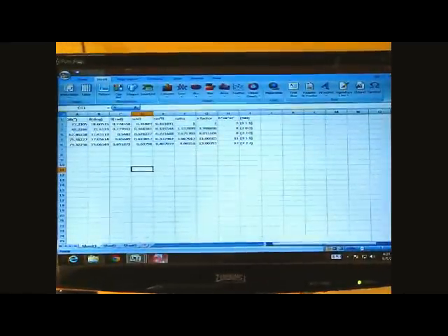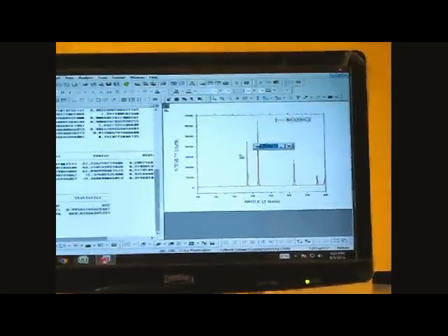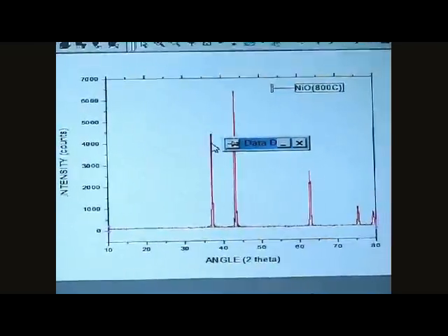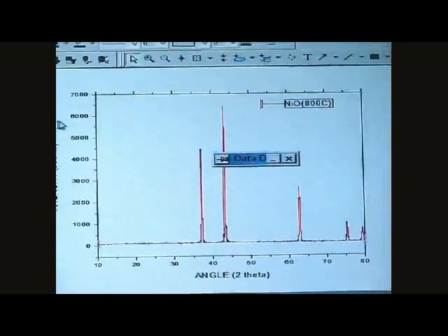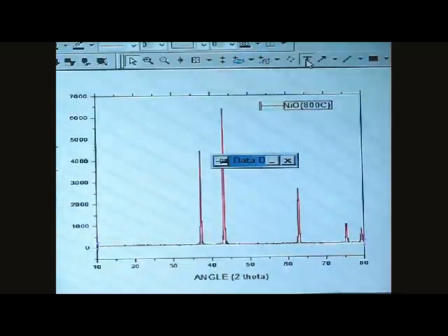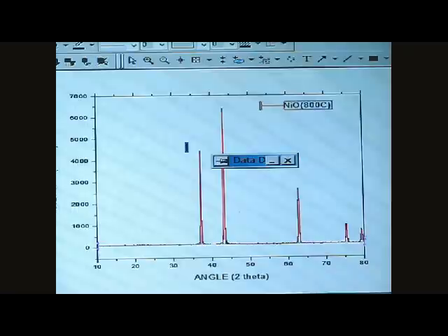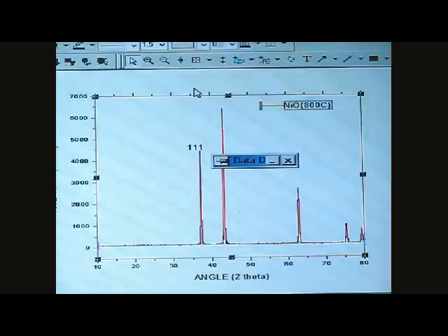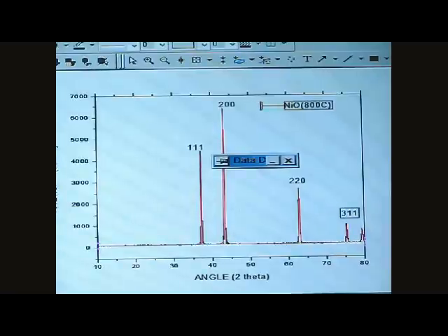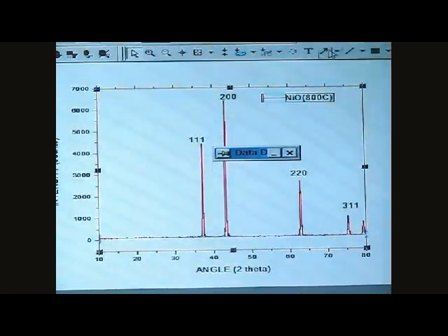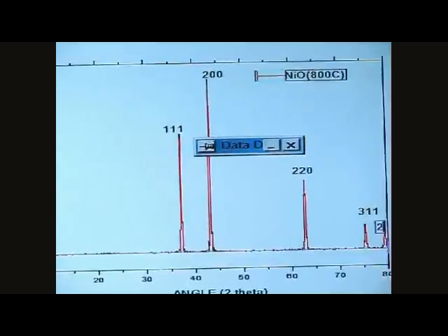So we can mark it on the Origin profile curve. That is, take the Origin profile graph and mark the Miller indices on the corresponding peaks. For this, take the text box. First curve is 111. Next curve is 200. The third one is 220. And the fourth one is 311, and the last one is 222.